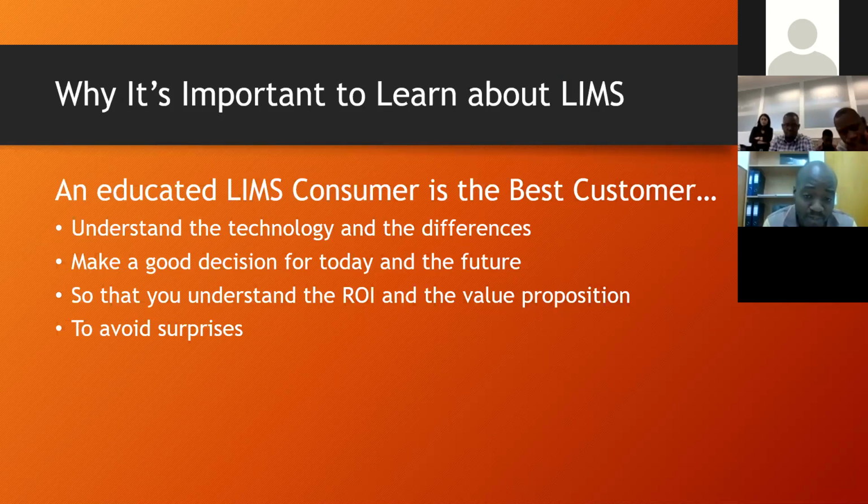So it's important for a customer, or for whoever wants to acquire an LIS, to fully understand the technology and the differences that exist. If you are in the process of trying to acquire a LIMS, it's important that some research is done so that you understand the technologies that are available and the different packages they have to offer, so that the decisions you make today are not going to hurt you in the future. That is very, very important.